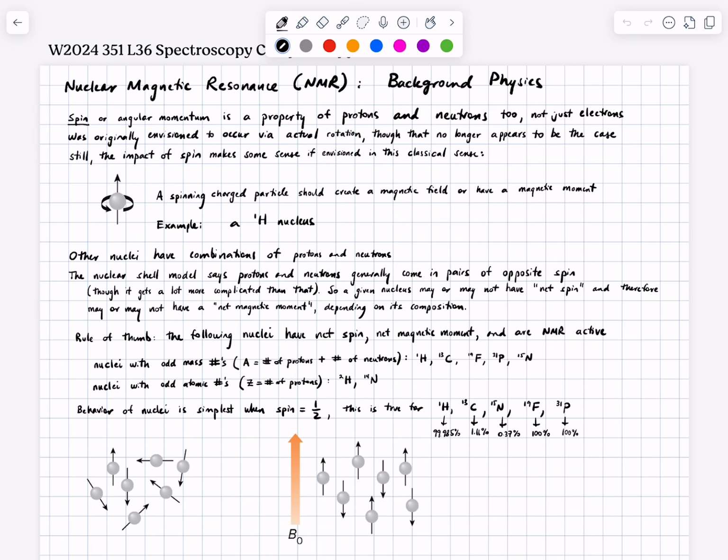So we've dealt with verifying the mass of our desired compound. We've dealt with identifying what functional groups are present in our desired compound. But so far, nothing has given us the tools to unambiguously assign the connectivity or the bonding in our compound of interest. Nuclear magnetic resonance is a technique that allows you to see the connectivity between carbons.